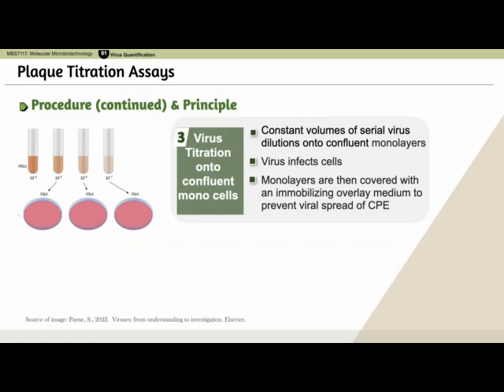And then we are going to cover our monolayers with an immobilizing overlay medium to prevent viral spread and CPE. Now let's look at the principle underlying this.